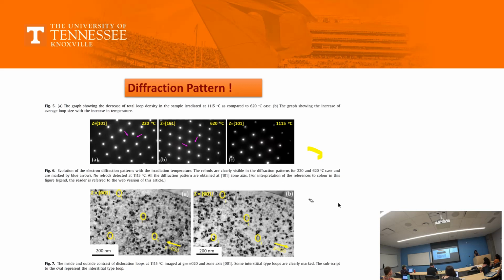Okay. Aren't they just simply rotated for the large part? To my eyes, they're just simply rotated. And you can literally create the same kind of things in all directions. So in these situations, what we do is we measure a D between them. And once we measure the D, the entire pattern kind of changes.